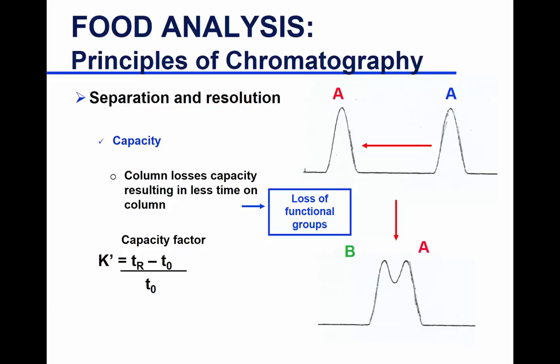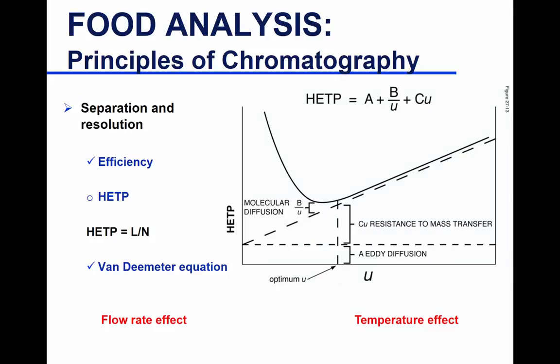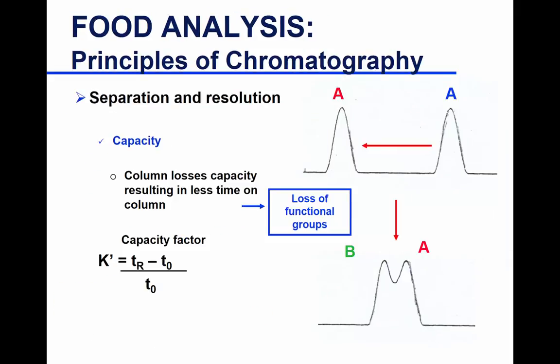Yeah, so this is the time until you see the solvent front. The time it takes for the void volume to come out.